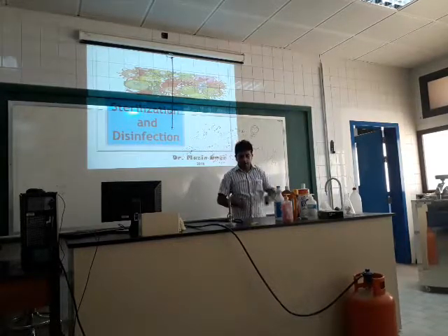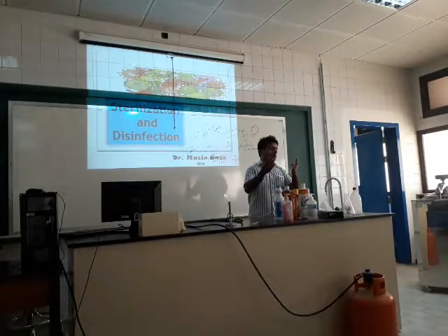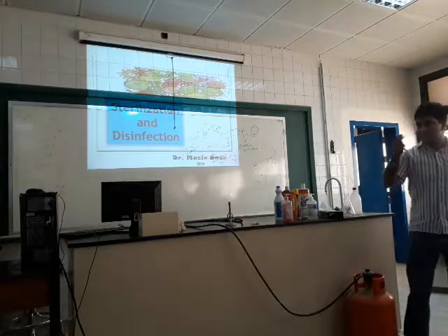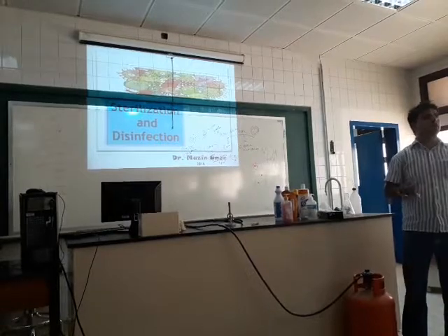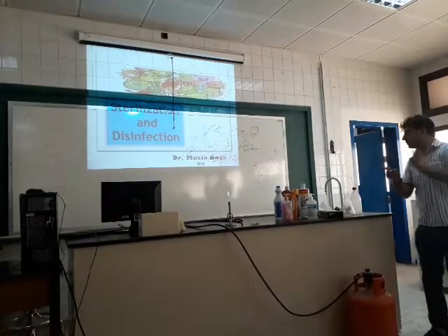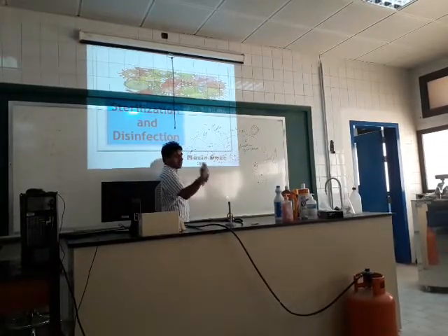Now, here I am having the bacterial spore. Now I want it activated. There is a way. What's the way? How can we activate the spore? We cannot see a bacterial spore by naked eye, but under the microscope, we put it in water and heat it to 60 degrees. When it is heated to 60 degrees and we put it to cool, during this time the spore gets transferred back into the vegetative state. This is the method we can use.